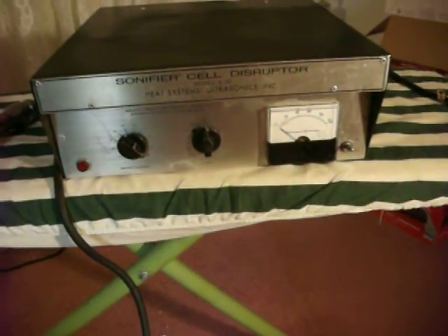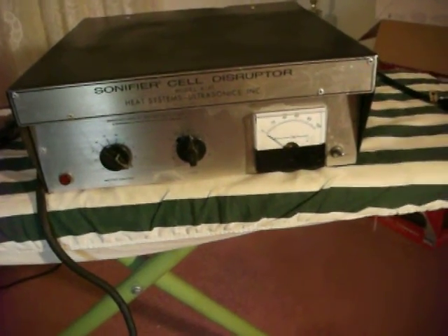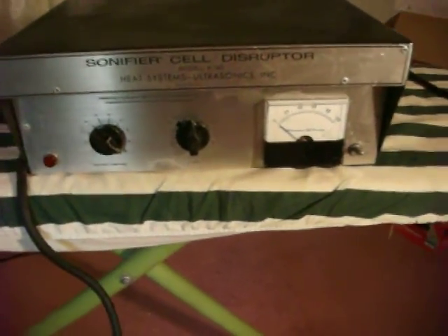Okay, here it is. What is it? It's a Sonifier Cell Disruptor Heat Systems Model W140. Heat Systems Ultrasonics. Transducer.